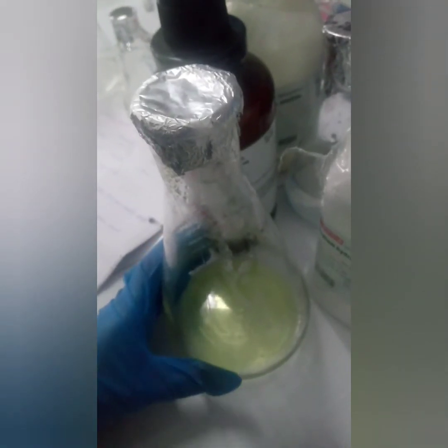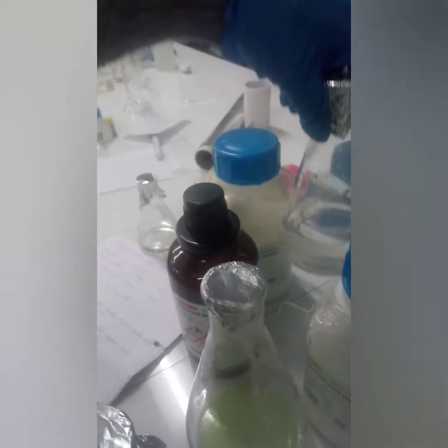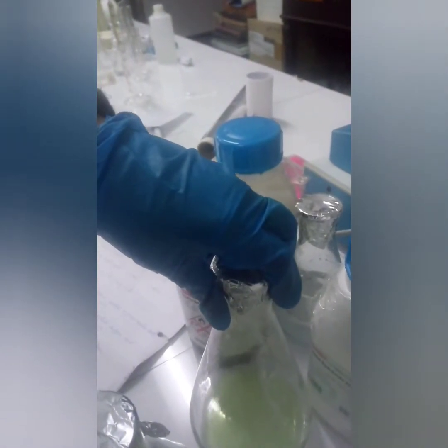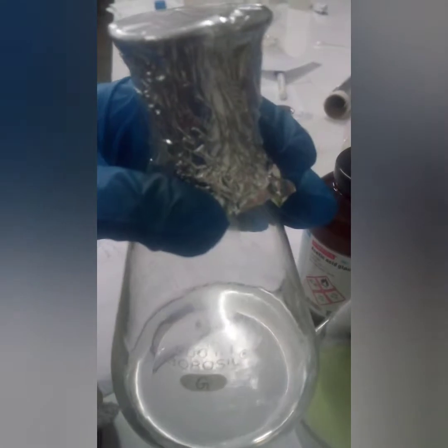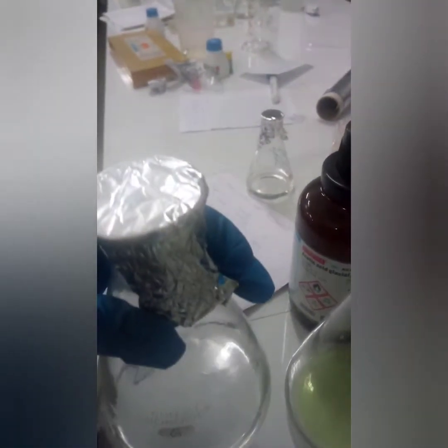Later we prepare the Ninhydrin reagent by taking 92 ml of this sodium acetate buffer and mixing it with 8 ml of this Ninhydrin. Then we will have the Ninhydrin reagent, which we will use in our experiment.